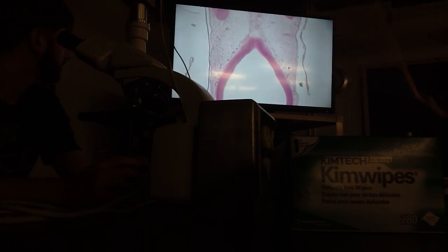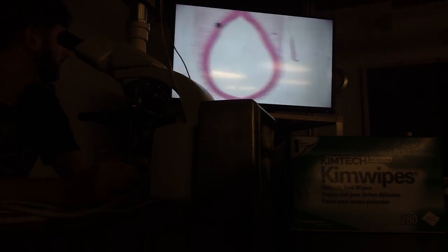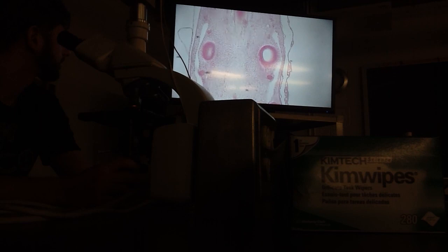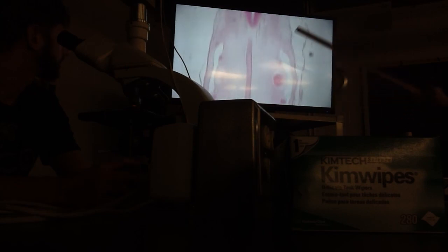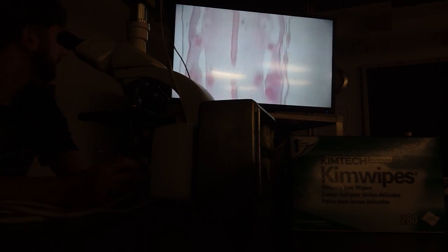And as you pass through the brain, go to the next slide, you will strike the notochord. Show notochord. One more. Here's the notochord right down the center. And as you cut through it, it may break into 2 parts, an anterior and posterior part.